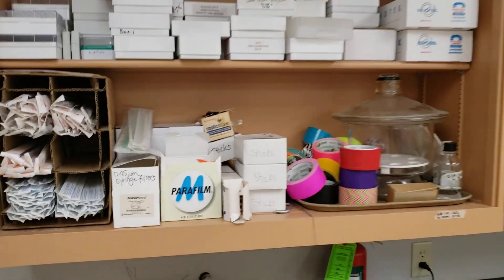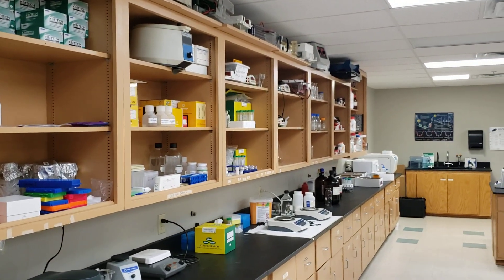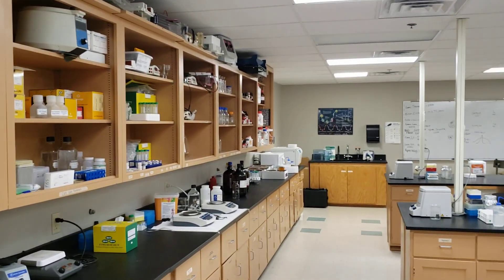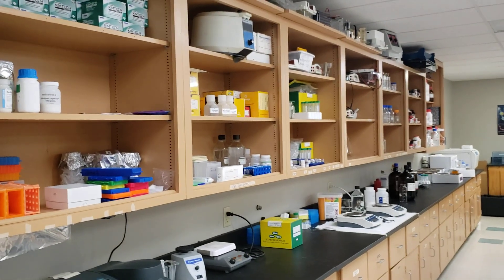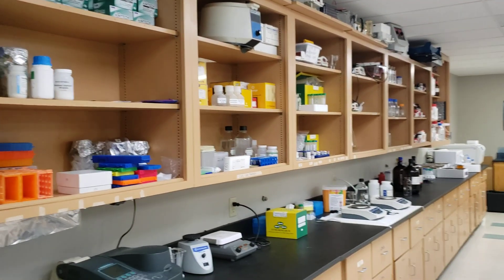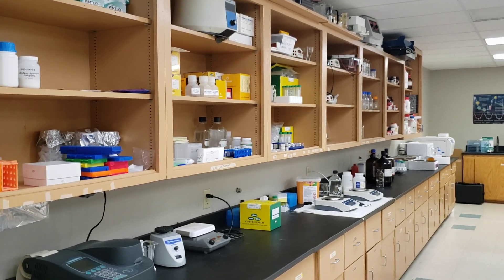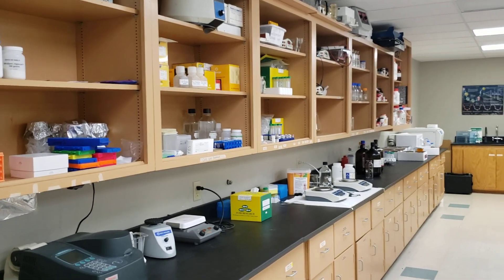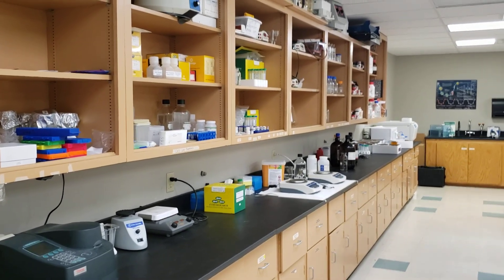I also have a whole bench of bottles, tubes, and beakers that students can use. I do not tell students what size beaker or bottle they need — if they're making running buffer or gel running buffer, they have to decide what size they need, go get it, use it, wash it, and put it back.